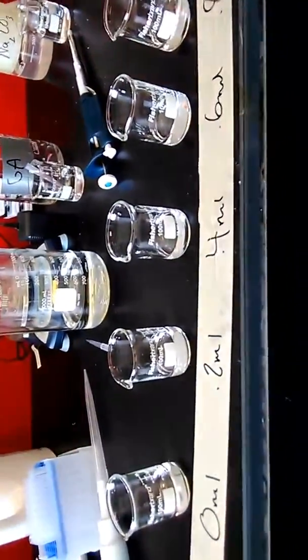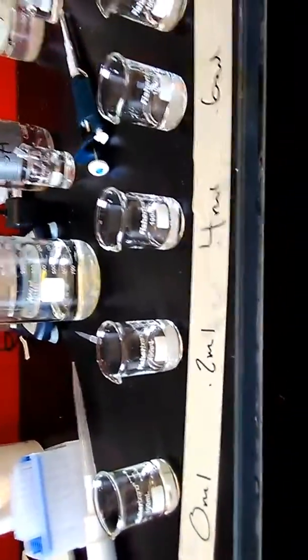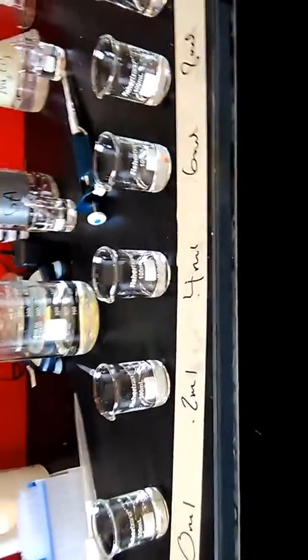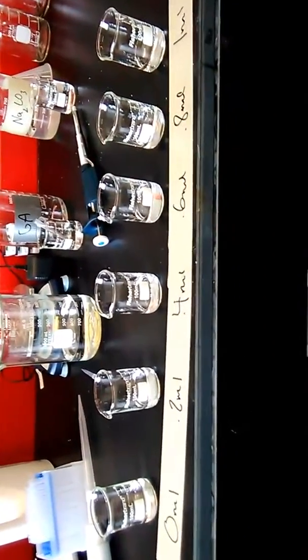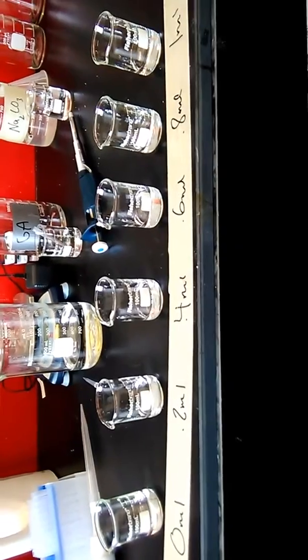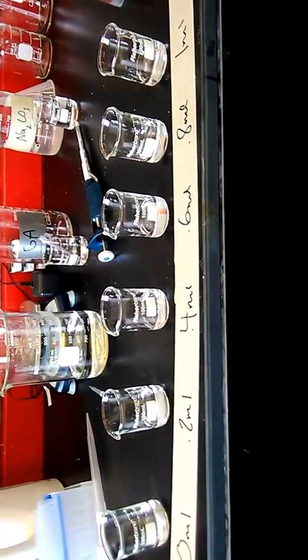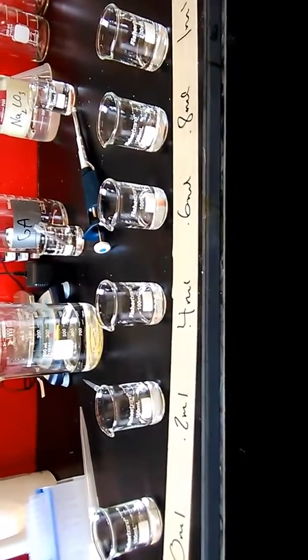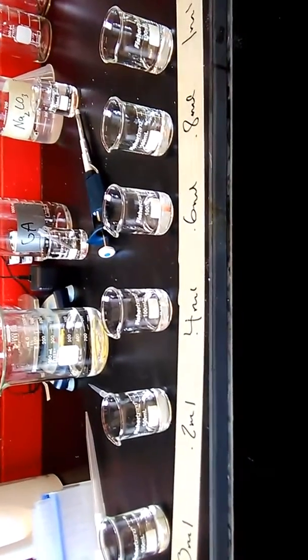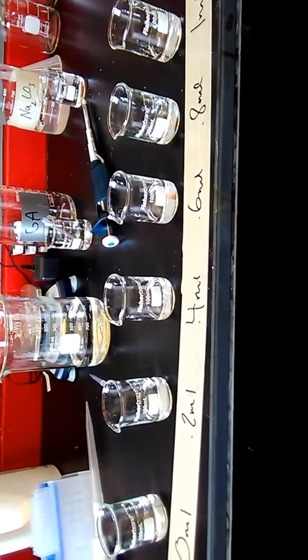Hi, welcome back. And now we are making a standard curve with gallic acid. Basically, we're substituting gallic acid for the juice to set a standard or a curve of what the reactant should look like.